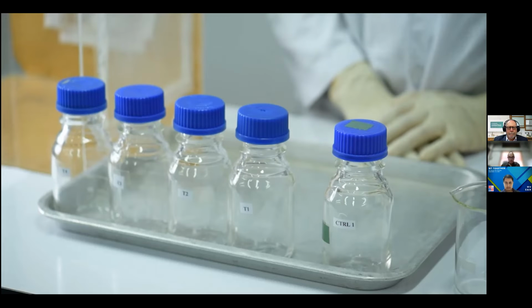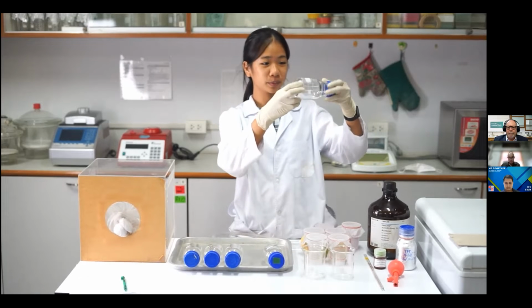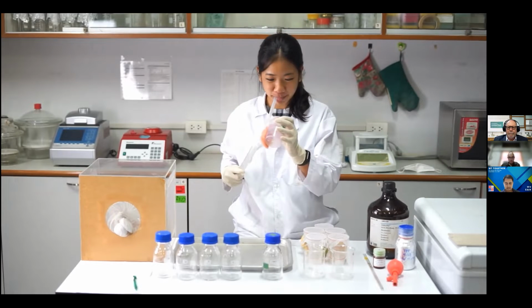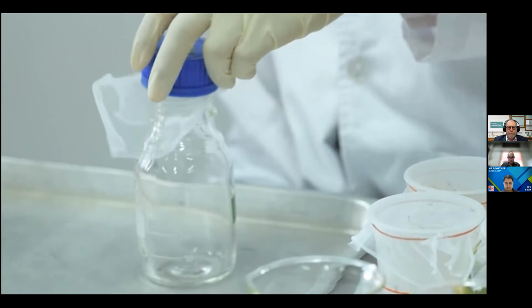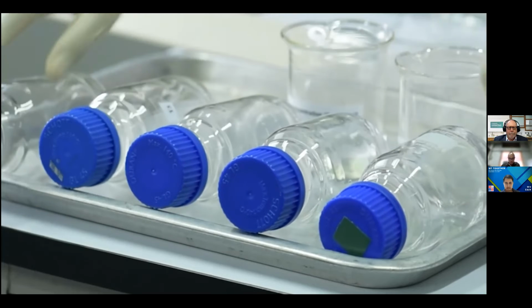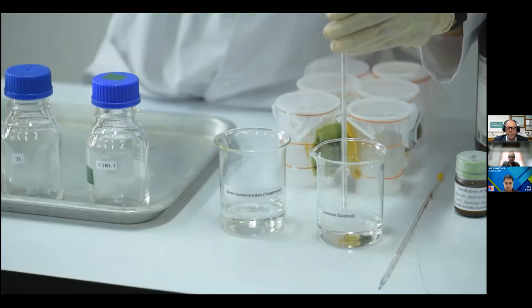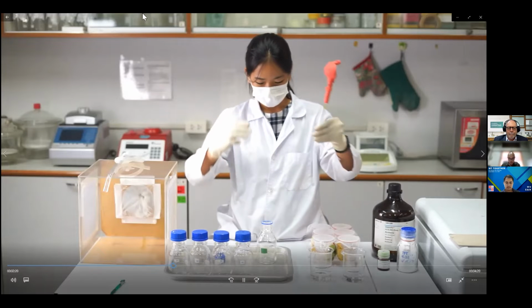So we start by coating the bottles as follows. You need to have made sure that all bottles are clean and uncontaminated, and you do that by using test mosquitoes to check on mortality. So first, check that all the bottles and caps are completely dry. Add 1 milliliter of acetone into each of the 2 control bottles and put the caps back on tightly.